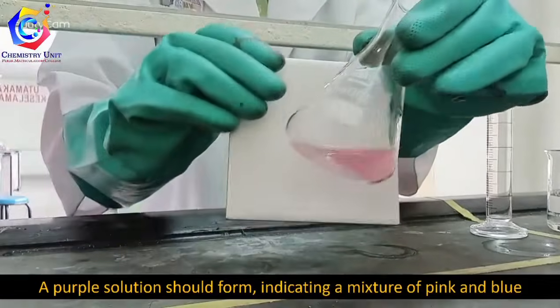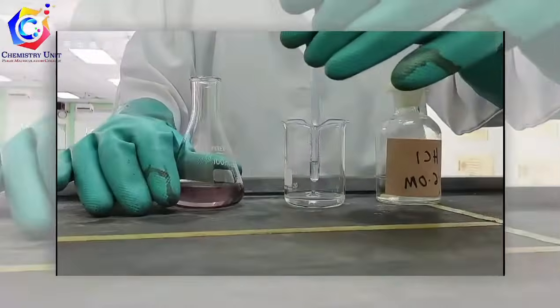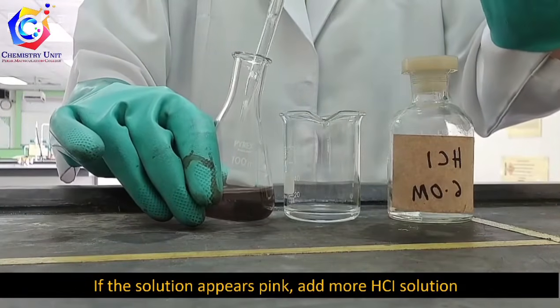A purple solution should form, indicating a mixture of pink and blue. If the solution appears pink, add more HCl.